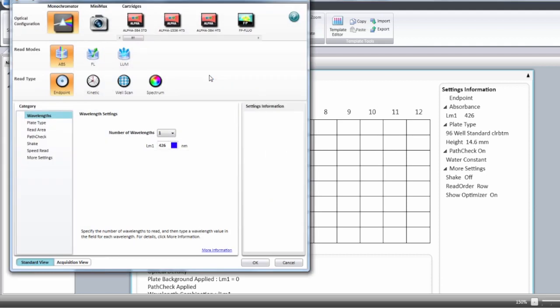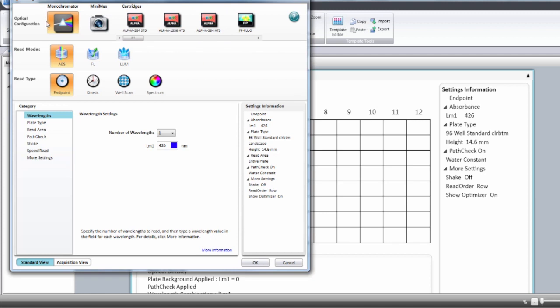In the instrument settings some instruments will have optical configuration. That will be for the i3, i3x and powerline. Then you will have the read mode and you have to select absorbance here.